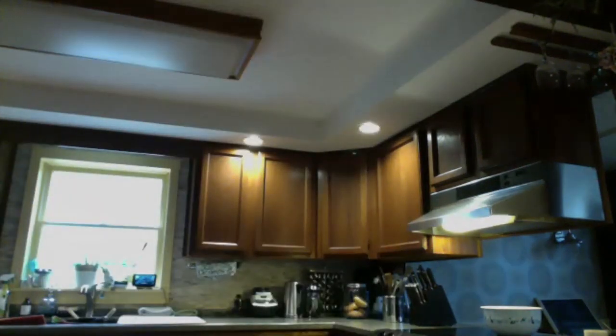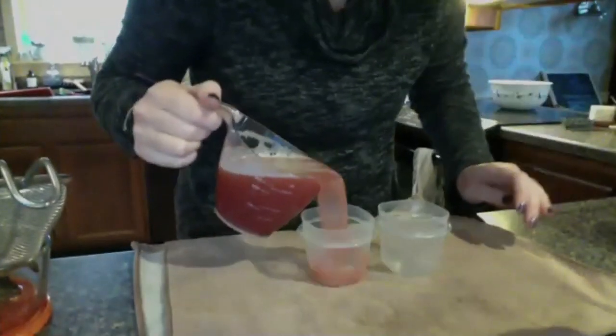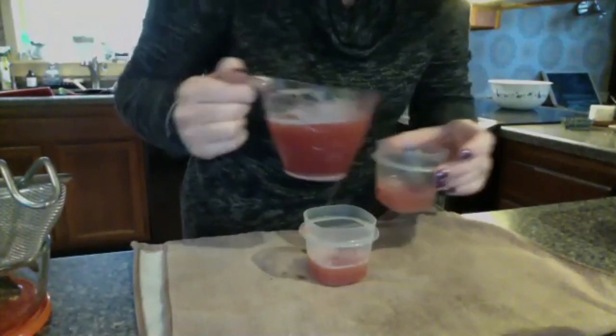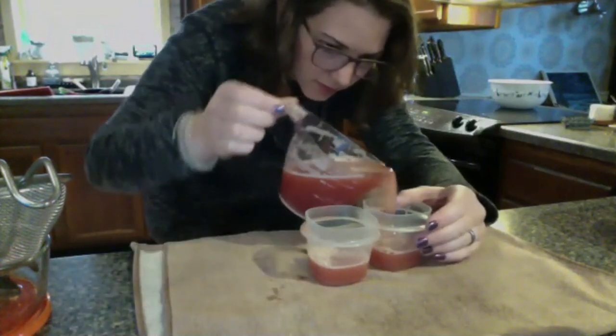So now we've got our soapy mixture. It says pour the mixture into two test tubes or other small glass containers. I don't keep test tubes at home — I'm a science professor, but maybe I should start. So I'm going to just use little salad dressing containers, like little Tupperware, about one third full each.